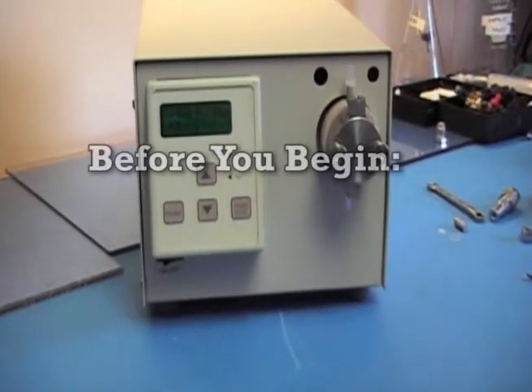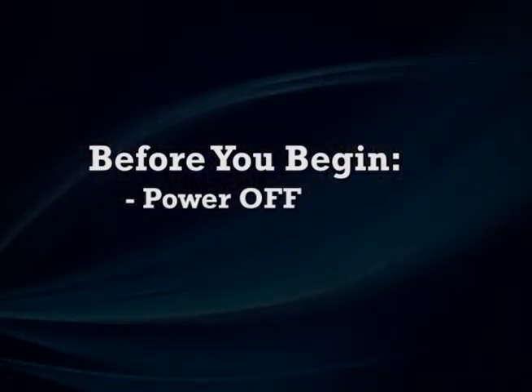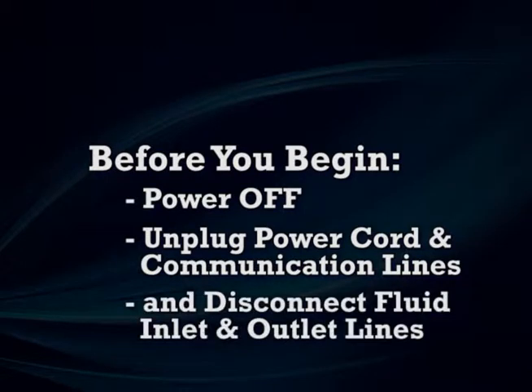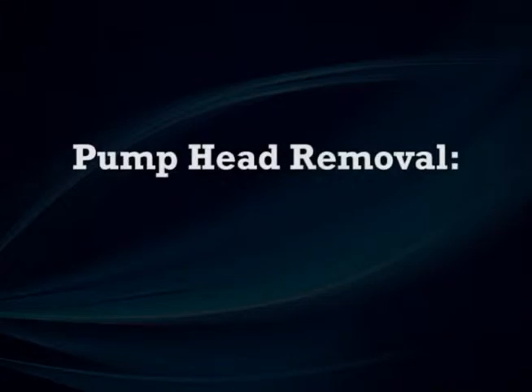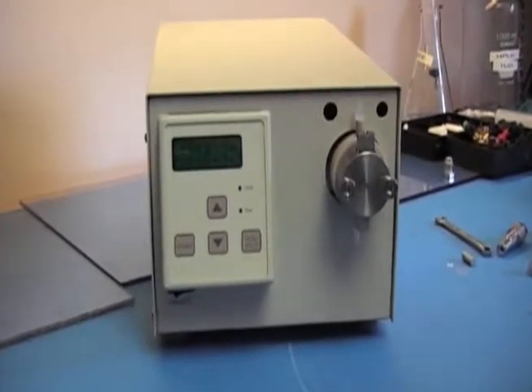Before we get started, make sure you power down your pump. Make sure your power cord is unplugged from the back, as well as any communication lines you may have hooked to the back. Remove all tubing from your fluid path, your outlet and your inlet. Remove that from the pump.